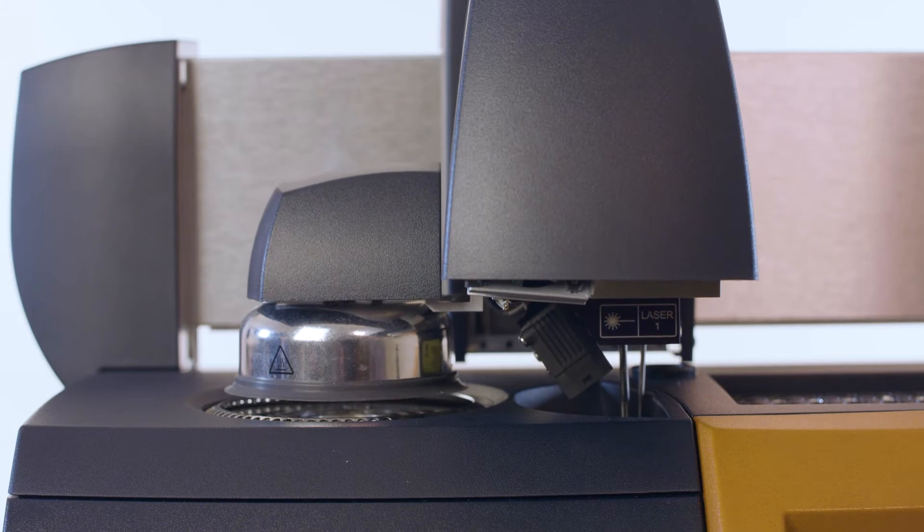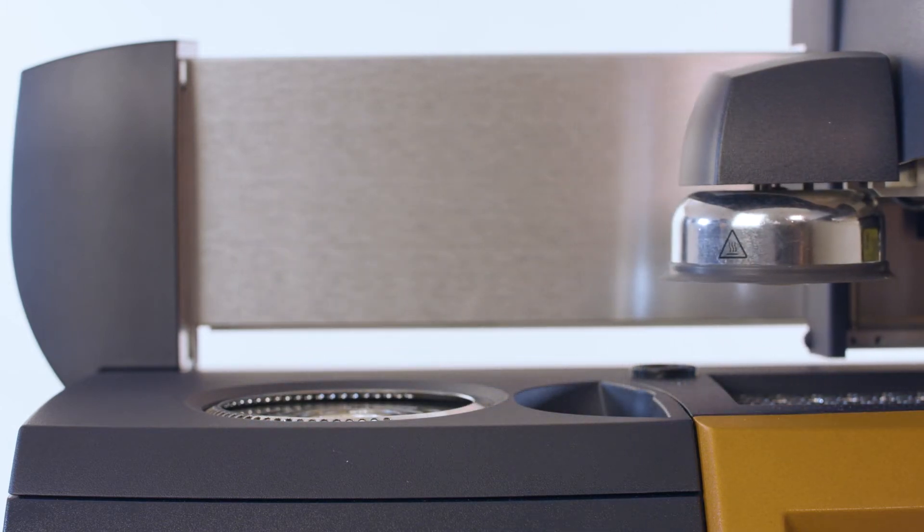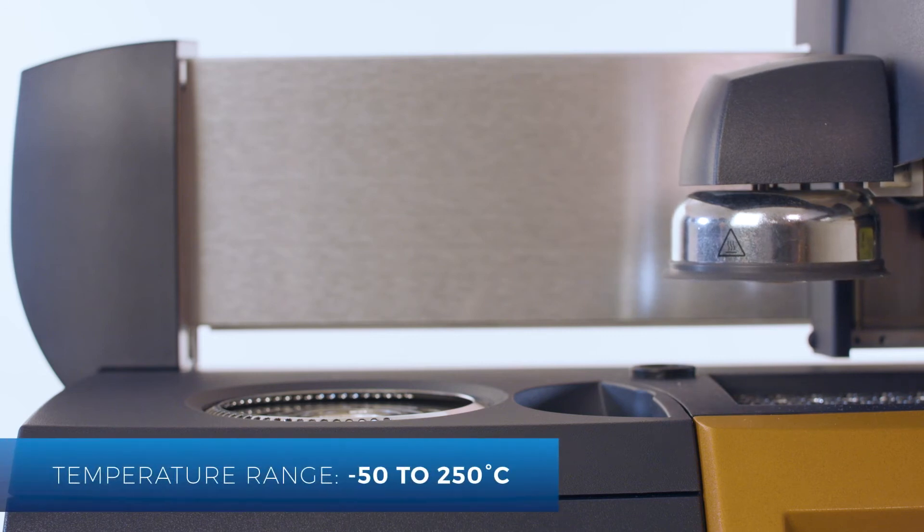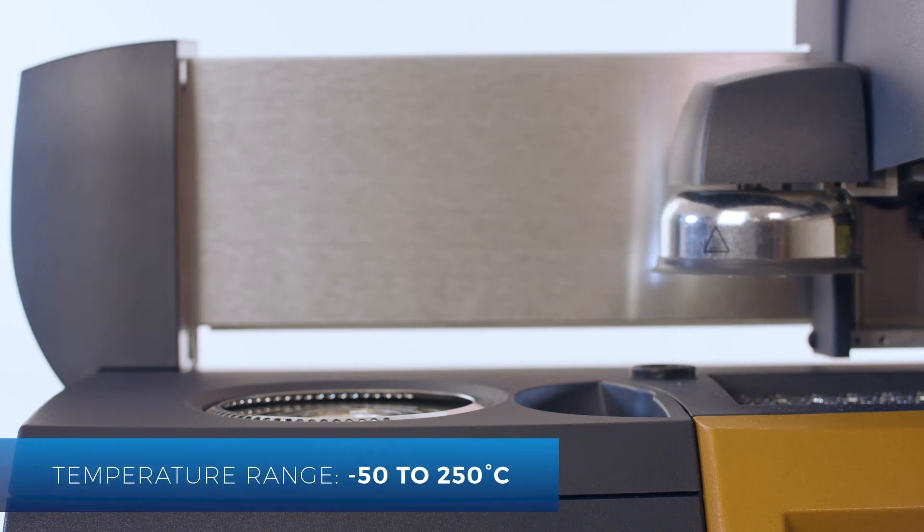Most PCA experiments are run isothermally. PCA experiments can be performed in the temperature range from -50 to 250°C with the dual quartz light guide supplied.